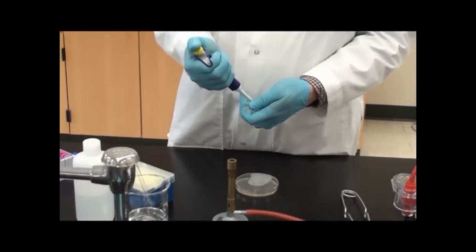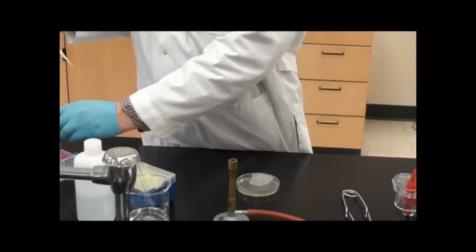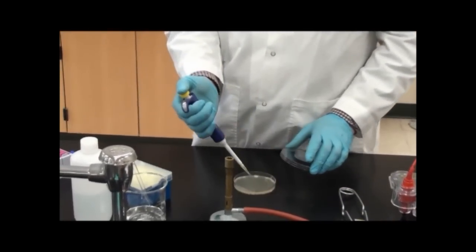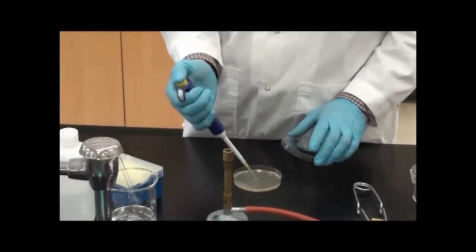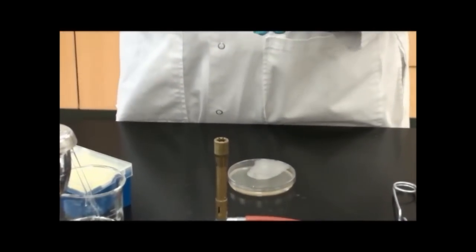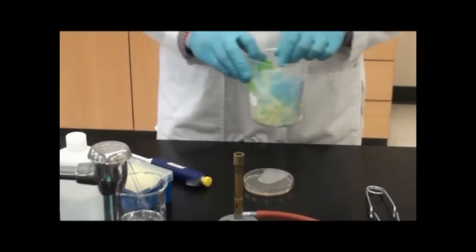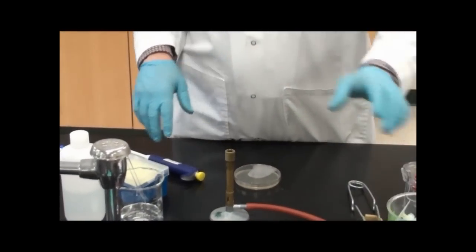I'm going to pull out about 50 microliters of sample and place it right in the middle of the plate. Cover it back up. This has been contaminated so I'll put it in my waste container and autoclave that later.